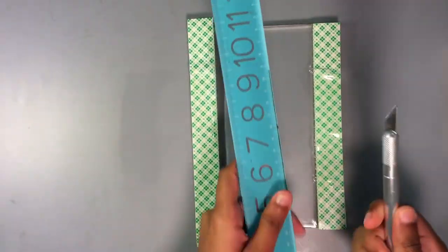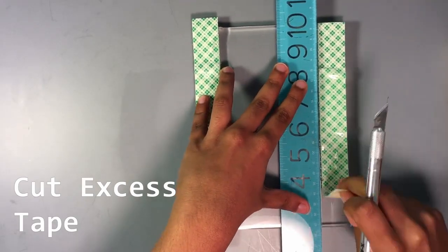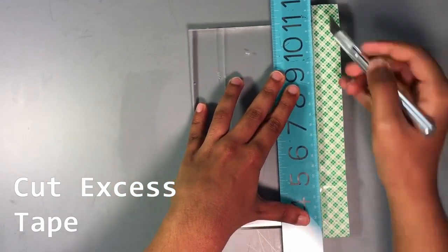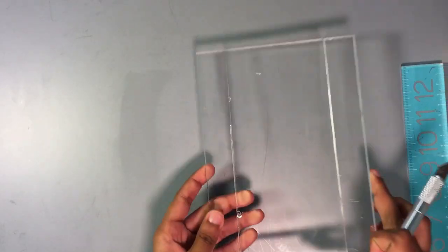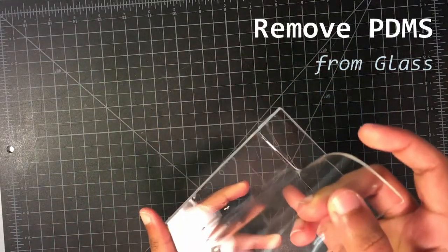First, use a ruler and an exacto knife to slice off the tape around the edges. Discard these pieces. Prepare a cutting board and peel off the PDMS from the glass plate, being careful to avoid any tears.